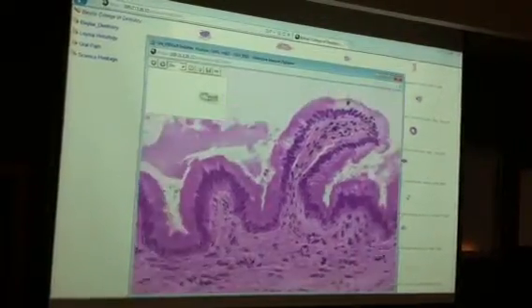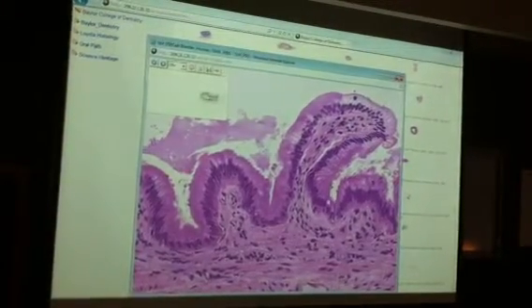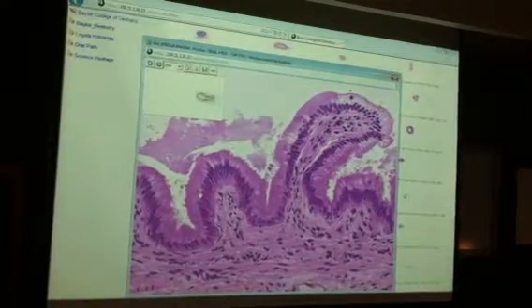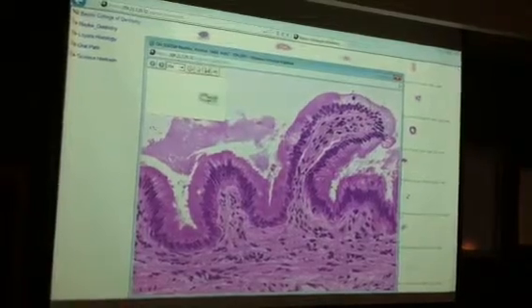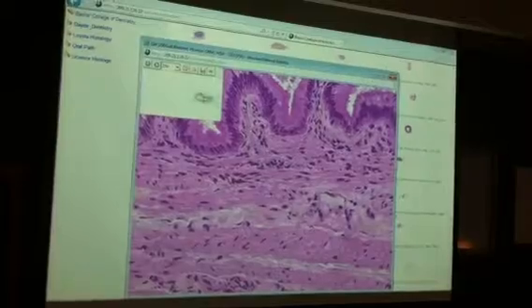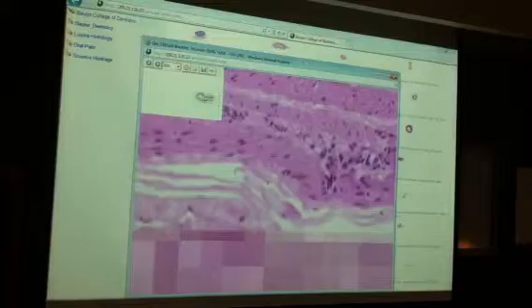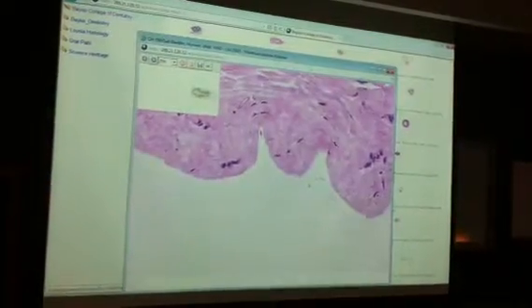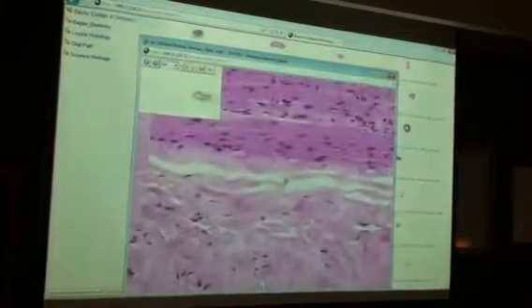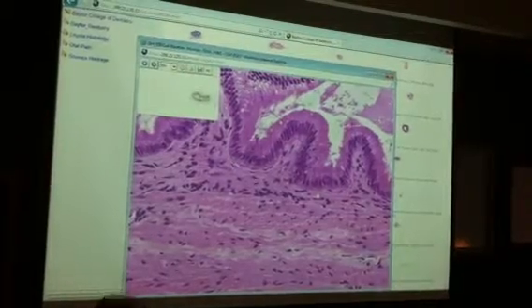Okay, so if there was an arrow pointing, pick your spot, right here, pointing right here, and said identify the tissue. What would you say? Simple columnar. If there was an arrow right here, it said identify the tissue. If there was an arrow like right here, nothing to it, right?